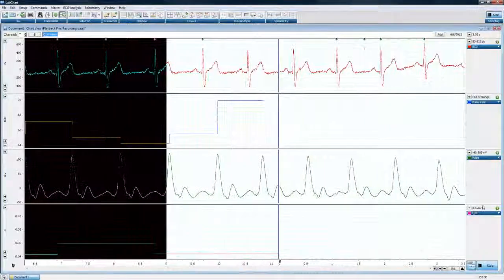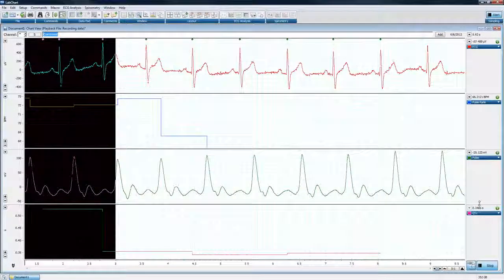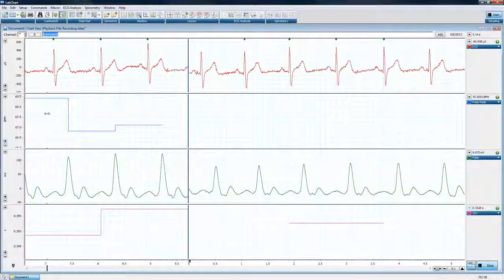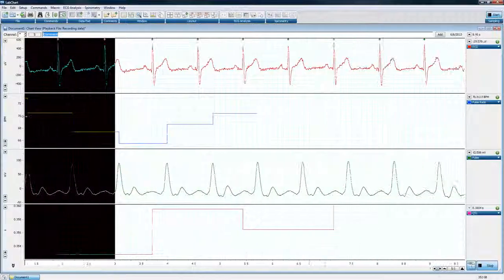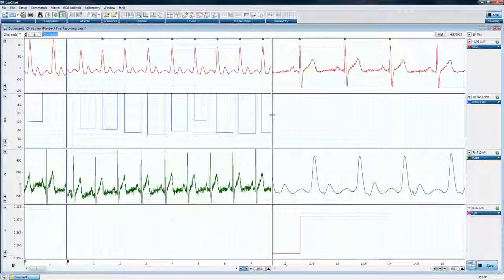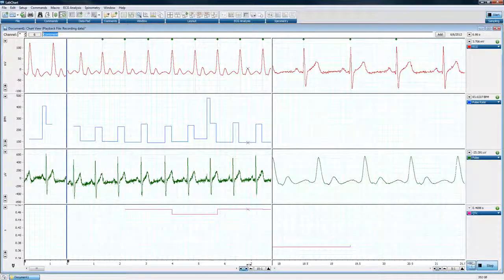Some of these next two features you may be aware of, but these are really cool things that we show people a lot. They made the cut because they're really cool things that you can do when you're recording data. And that is, first, you can use the split view, and to do that, you're going to hover your cursor over the left bar in the chart view. You're going to grab the left bar and pull it out. And what that's going to do is split the screen in half. It's going to split the chart view in half for you.